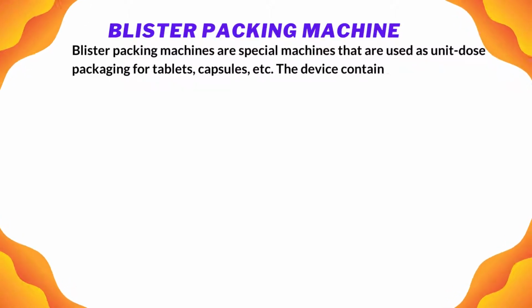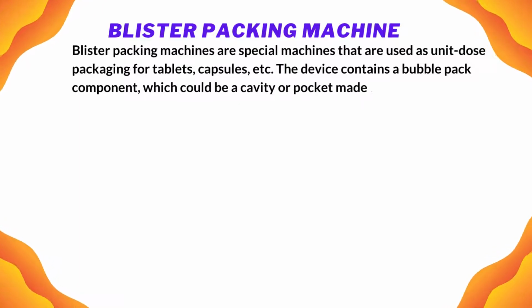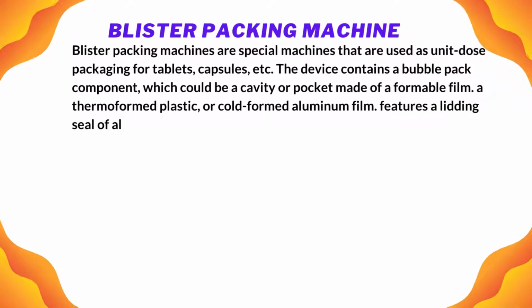The device contains a bubble pack component, which could be a cavity or pocket made of a formable film, a thermoformed plastic, or cold-formed aluminum film. It features a lidding seal of aluminum foil.